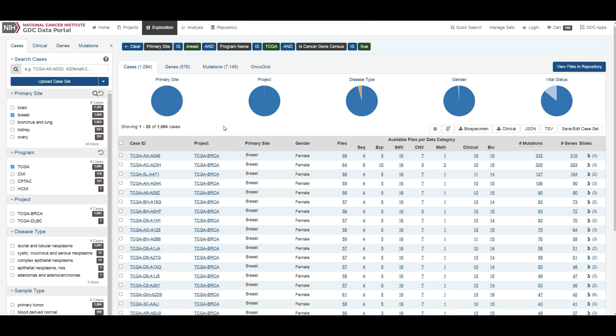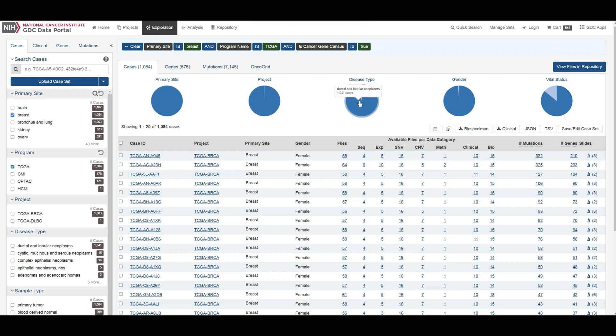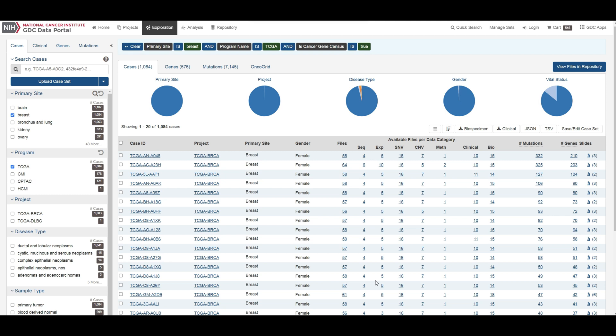The top of this section contains a few pie graphs with categorical information regarding the primary site, project, disease type, gender, and vital status. Below these pie charts is a tabular view of cases which can be exported, sorted, and saved using the buttons on the right. The case summary page displays case details including the project and disease information, data files that are available for that case, and the experimental strategies employed.